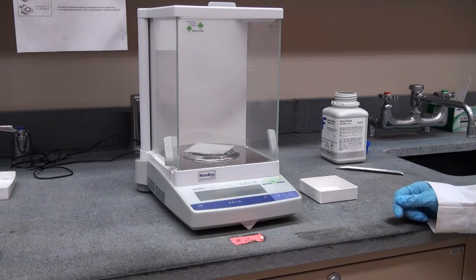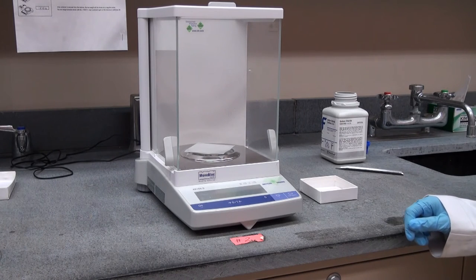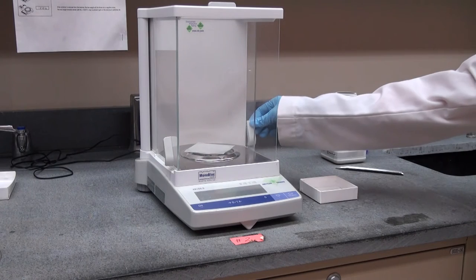It's important that we don't overload an analytical balance. Because its primary purpose is to measure masses very accurately, we should not be using them for measuring very large or heavy objects.